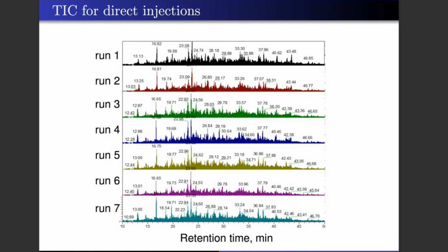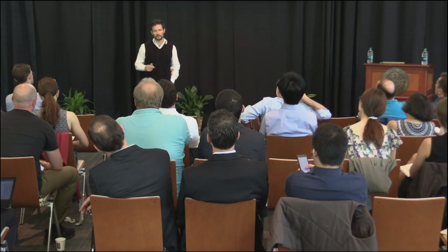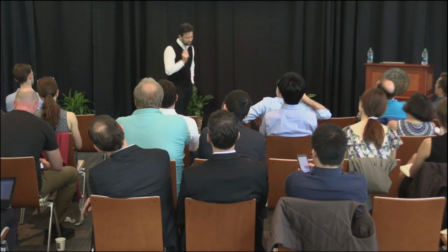And then the first thing to consider is, if we just inject 1% of the sample that I told you about, is the signal going to be larger than the noise? Because the way we prepared it, in the single cell channel, we cannot possibly have more than one cell's material. It can be less than that, lost from dilution, but it's not more than that.